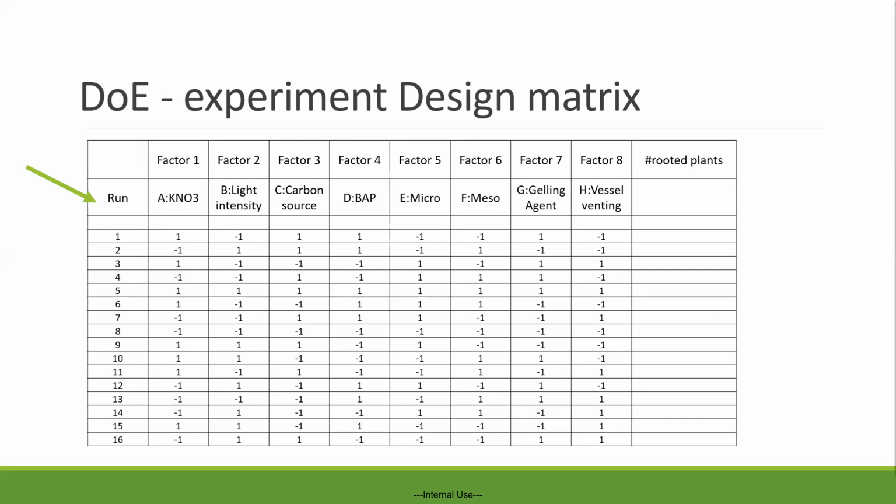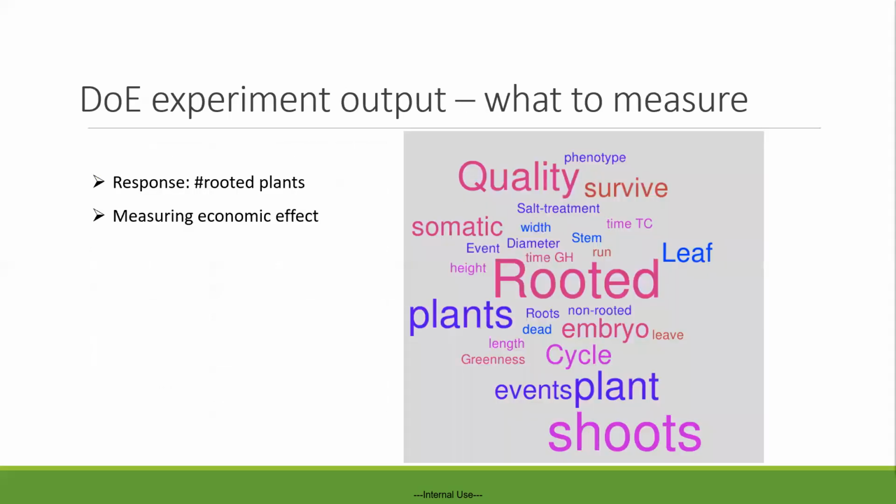And here, you can see the number for each factor. For example, for factor 1, you see 1 and -1. When you design the experiment in the software, there is a place where you can either enter the real value of each factor, low and high, or you can just leave it, where -1 is the low level and 1 is the high level, for simplicity. So in this case, I just leave it. And then you will go on and do the experiment and then collect the data.